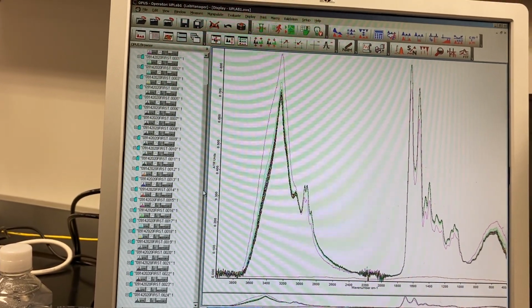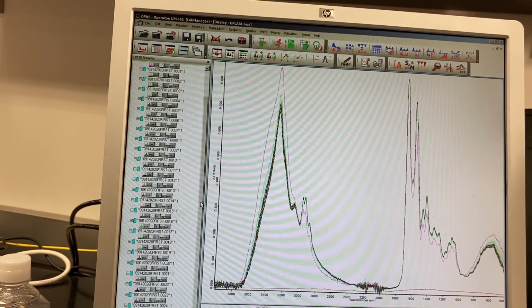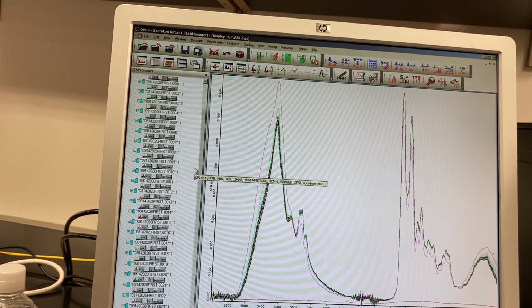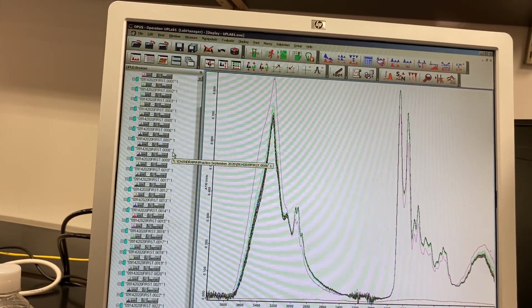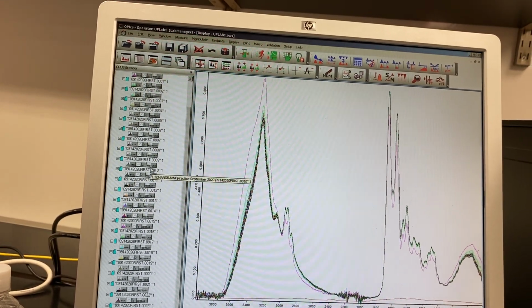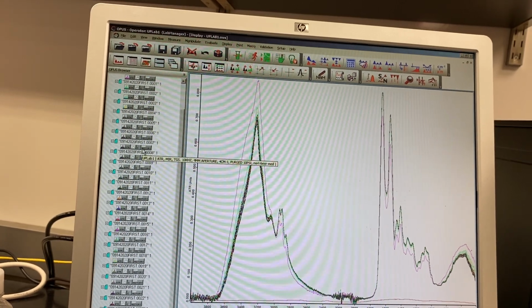So in the protocol I mentioned that we choose the last 6, which are the best reproducible. The serum spectral measurement may become stable, that is reproducible, after maybe the 10th spectrum, or you can play with that.